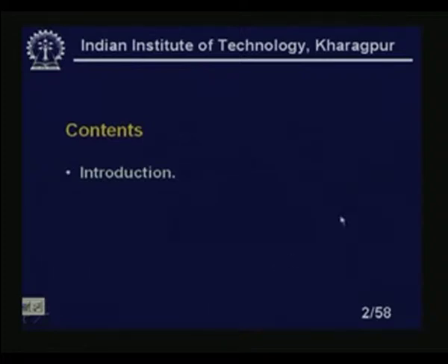Contents. We will basically have an introduction to the systems, what chromatography actually looks like, what the packing materials are, and where it is used. Chromatography is basically the separation of fluids, because in many industrial situations as well as in chemistry we need this when there is a mixture.